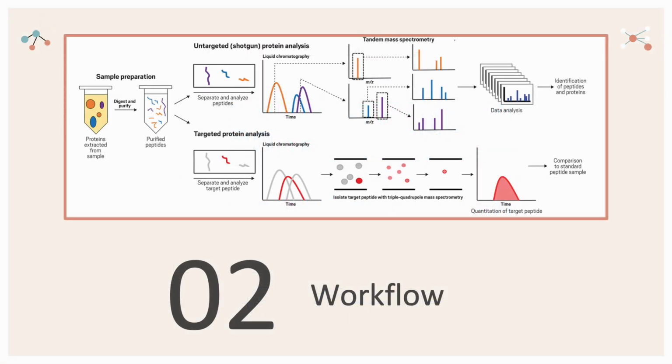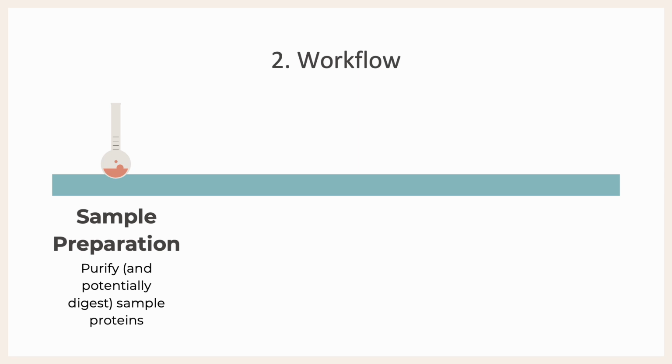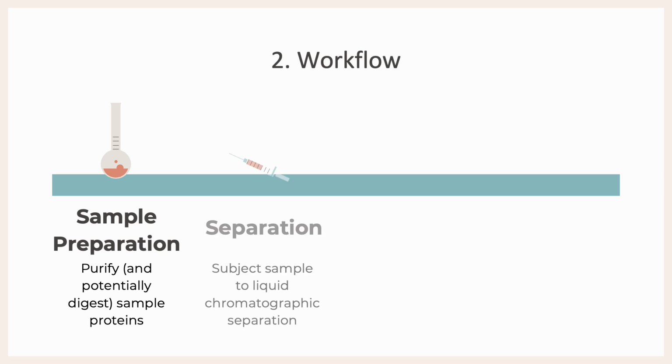So, moving on to the workflow and how to conduct proteomic analysis, we have essentially four steps that I like to break it down into. Number one, we have sample preparation, where you're purifying your protein and maybe digesting it too, which we'll talk about a little bit later. Number two, the separation. So we're using liquid chromatography to separate a singular protein from a bunch of proteins, essentially picking out which protein that we want.